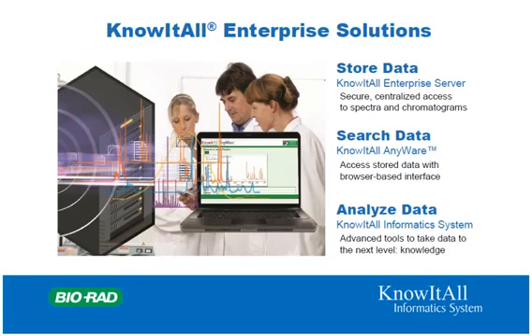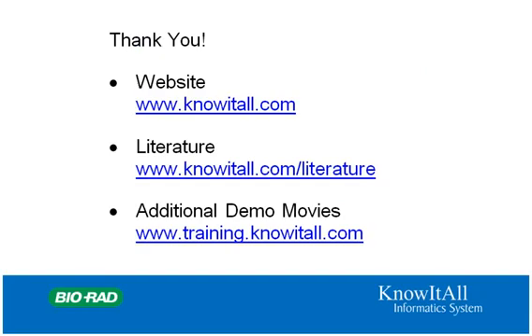Beyond basic database building, Bio-Rad also offers enterprise solutions to centralize and share spectra, chromatograms, and related properties throughout your organization. If you are interested in finding out more on how to extend your database throughout your organization, please visit www.knowitall.com/enterprise. This concludes our demonstration on building user databases in the KnowItAll informatics system.